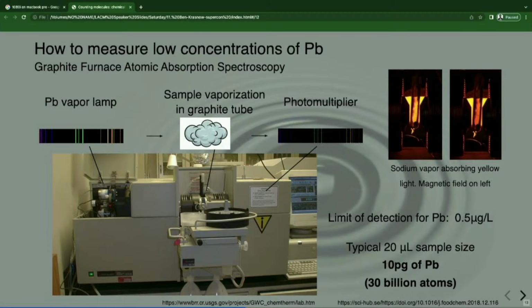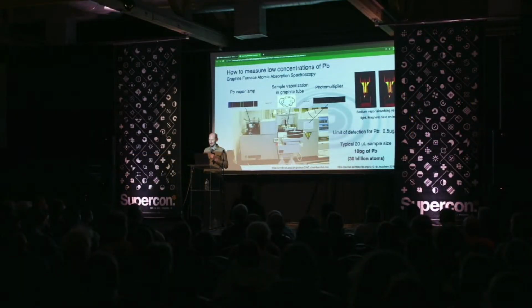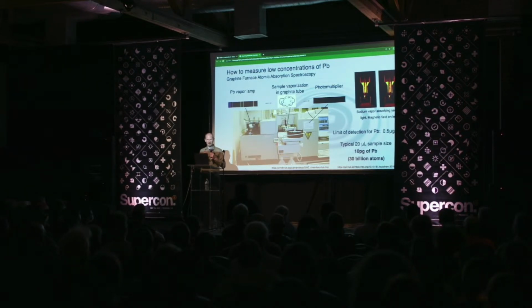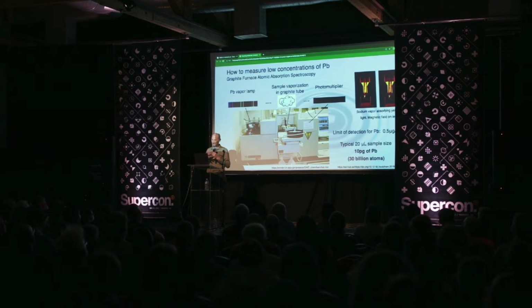I was telling someone, I work with these machines now, not this one in particular, but some that we'll see later in the presentation, we can detect down to a couple picograms. I mean, a picogram is like a couple billion atoms. This is amazing. And they said, oh, is that a lot? No, it's tiny. If you're ever talking about atoms in millions or billions terms, you're getting down to an extremely low level. So it's impressive that this little cloud of vapor works so well at absorbing light that you can detect this tiny, tiny threshold.